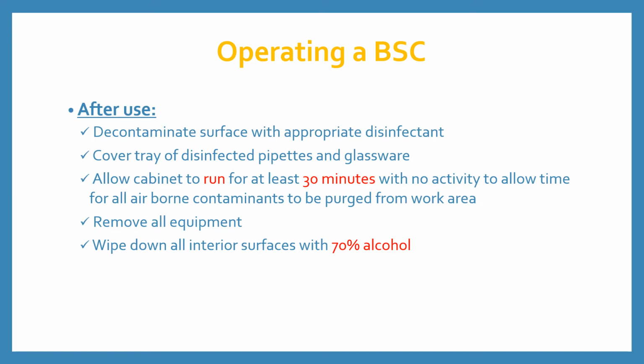Points to remember after operating a biosafety cabinet. Decontaminate the surface with appropriate disinfectant. Cover the tray of disinfected pipettes and glassware. Allow the cabinet to run for at least 30 minutes with no activity to allow time for all airborne contaminants to be purged from the work area. Remove all equipment. Wipe down all interior surfaces with 70% alcohol.